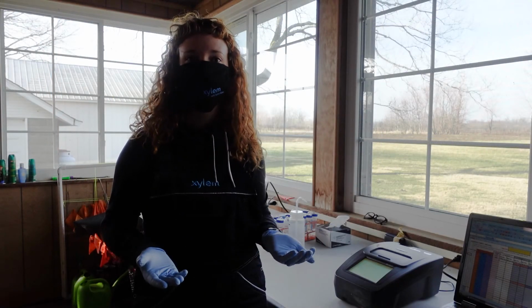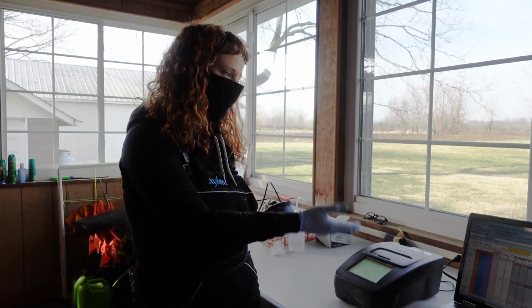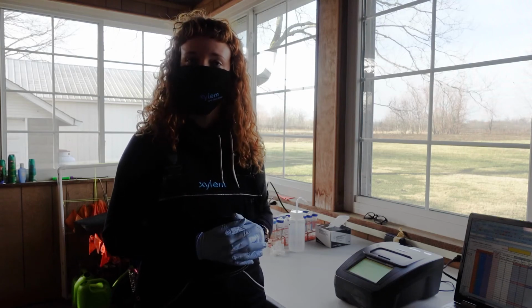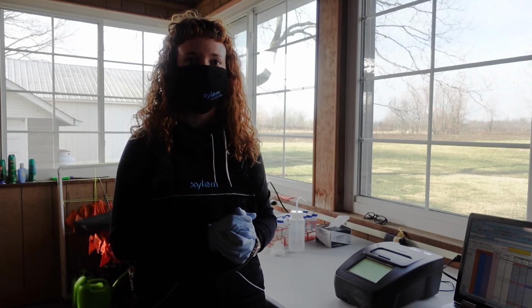All right, so you've run all of your samples for the day. You've entered all of the results into the spreadsheet. Click Save and alert a laboratory manager that you finished your measurements for the day.